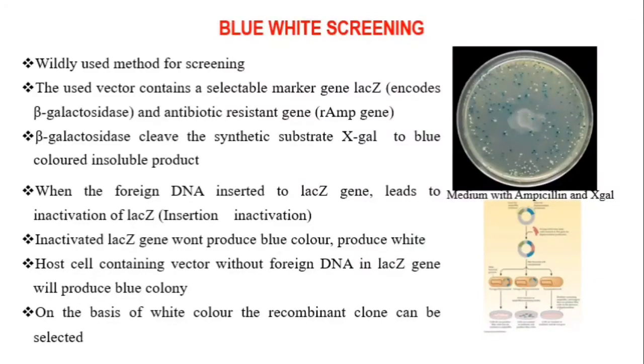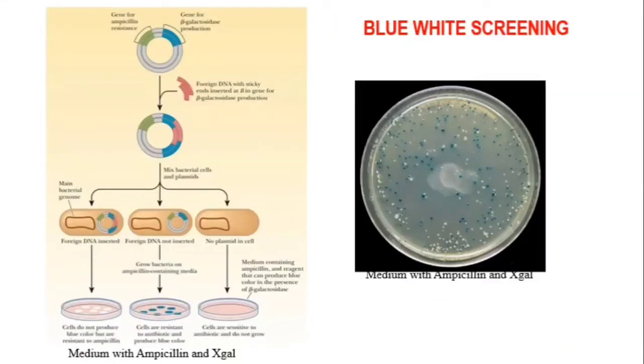Once the lacZ gene is inactivated, the bacteria containing it cannot produce blue colored colonies. The inactivated lacZ gene only produces white colored colonies when foreign DNA is inserted.